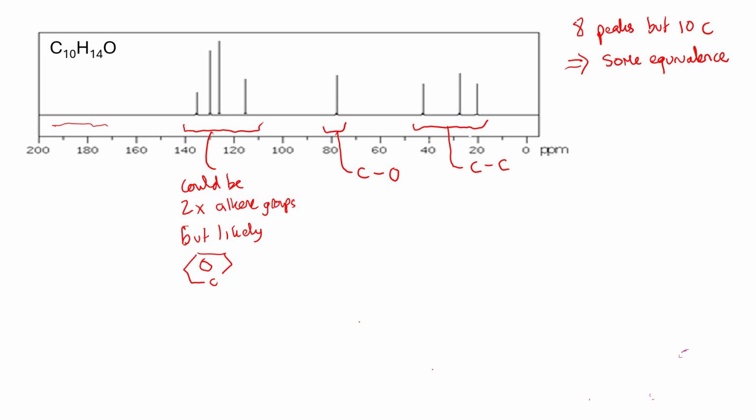And if it's a benzene ring, it must have some symmetry. There's only 4 peaks present.